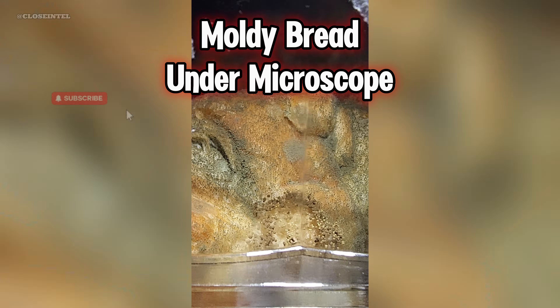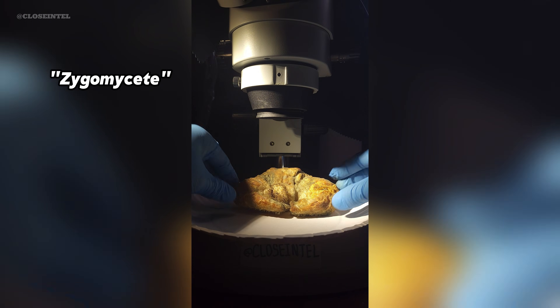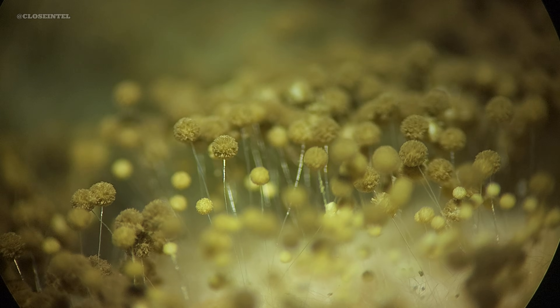These croissants have been sitting out for a little over a month at room temperature, turning into a fertile landscape for what appears to be a zygomycete mold species. Zygomycetes produce sporangia, which are these spherical structures supported by sporangiophores — the stalk-looking structures.